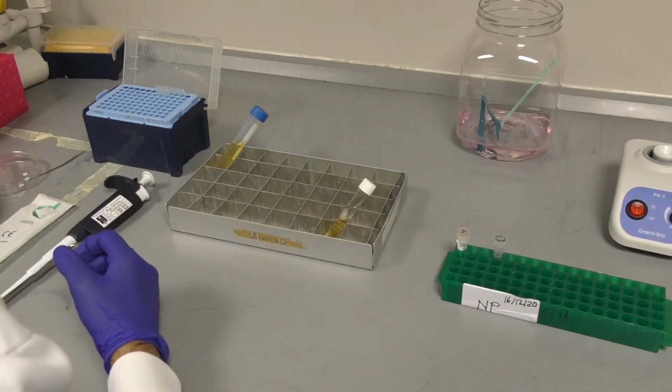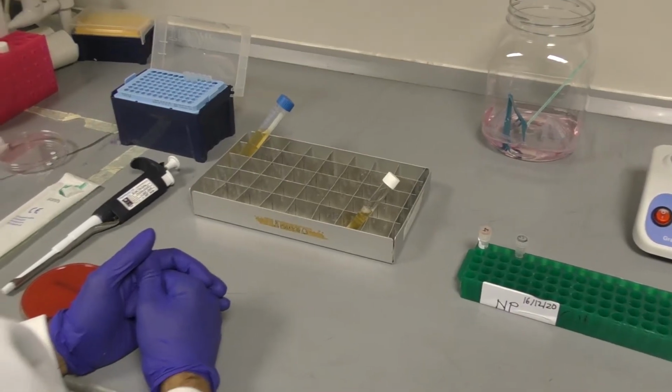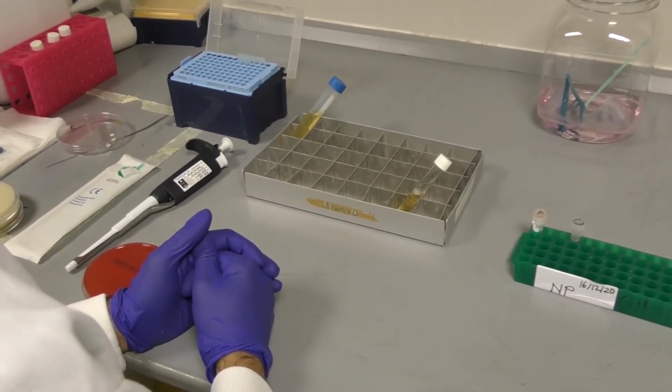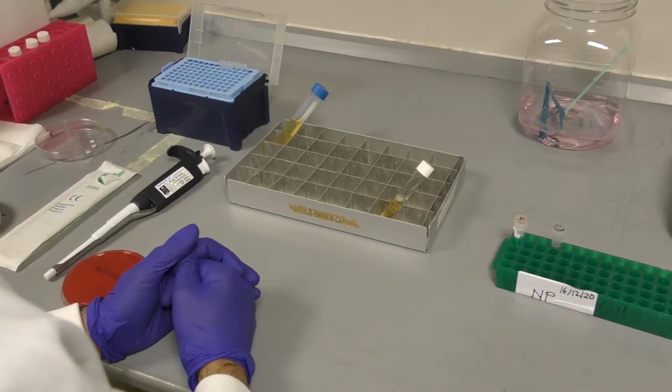Once you've prepared enough tubes for your samples, label all of these with THY for Todd Hewitt and the specimen number you are going to inoculate into it. You can do this using barcoded printed labels if you have them, or you can write the specimen IDs on manually.